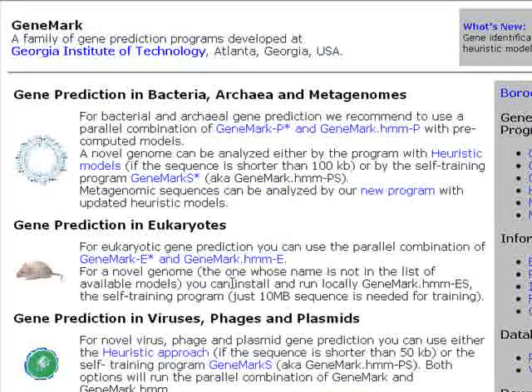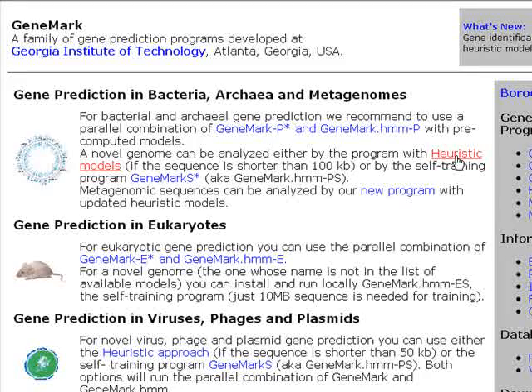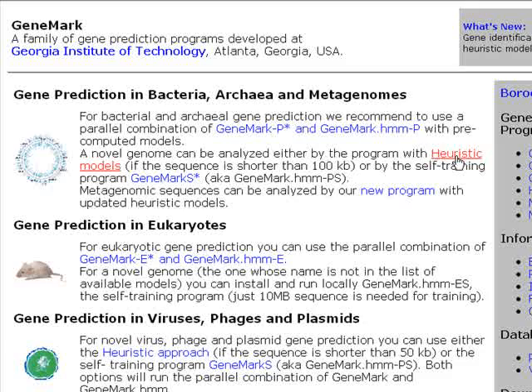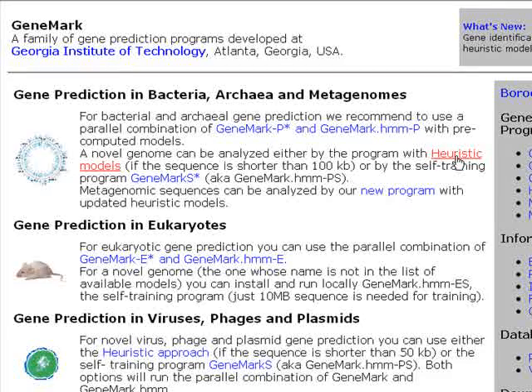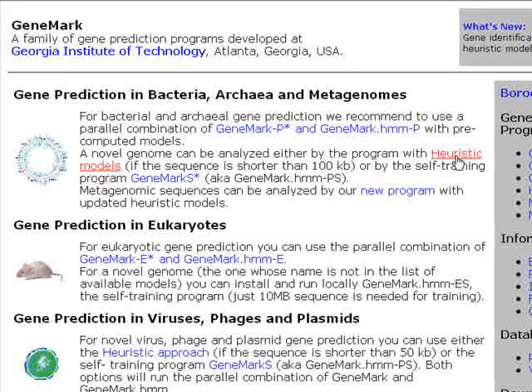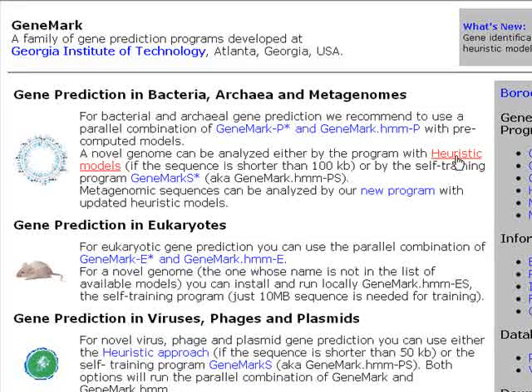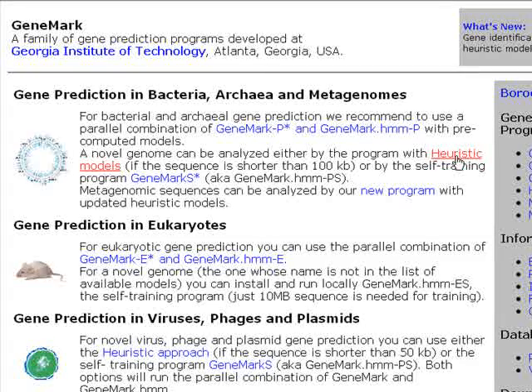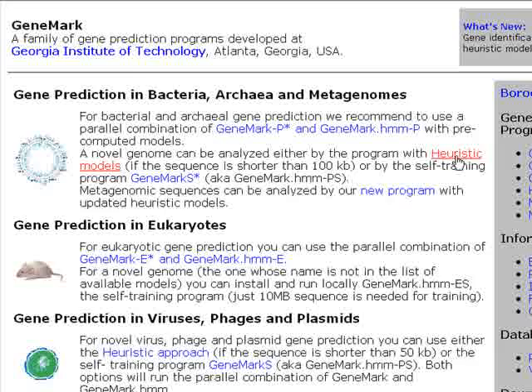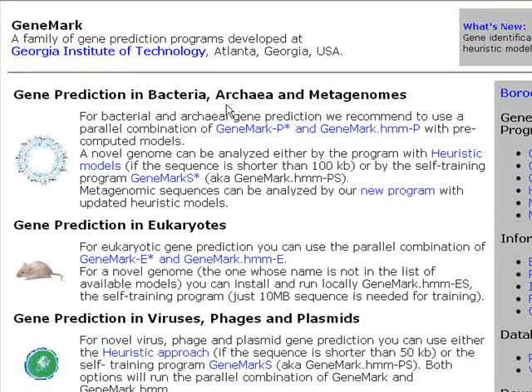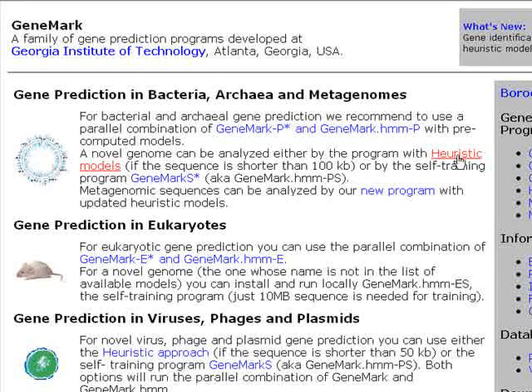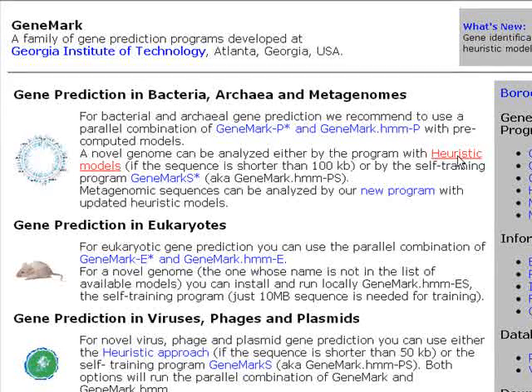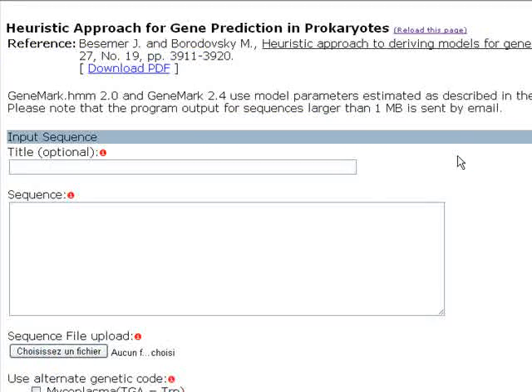In this tutorial I'm going to use a software called heuristic models which corresponds to the analysis of sequences from a new genome or a new organism. Let's say that you've sequenced a new genome and you want to locate open reading frames. Well this software is for you and it's for bacterial or archaeal or metagenomes only. Let's click on this software which is heuristic models.